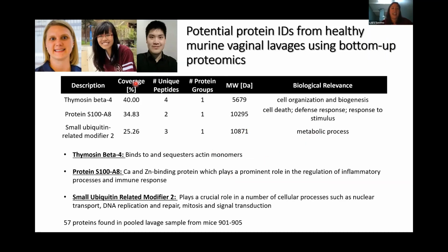And so again, we called our good friend Stephanie Colonna, and this time her student Mi Nguyen. And Gordon this time learned how to do some bottom-up proteomics to see if we could actually identify these, because working with small proteins, I think most people in this audience are well aware that it's actually kind of difficult, because you can either just digest them too much or not enough. But we did see here from healthy tissues that we can get signals and identify proteins in this small molecular weight region using a slightly modified setup.